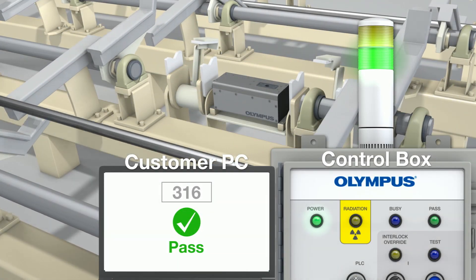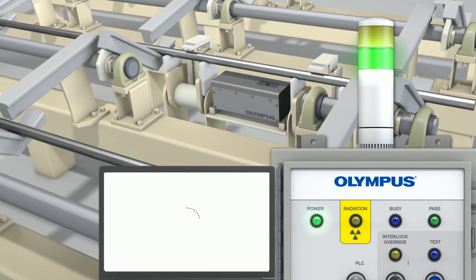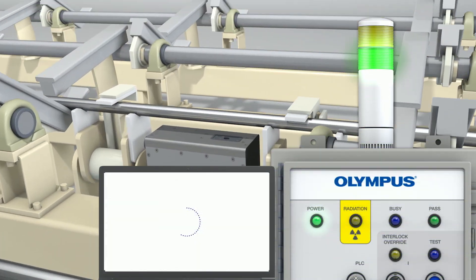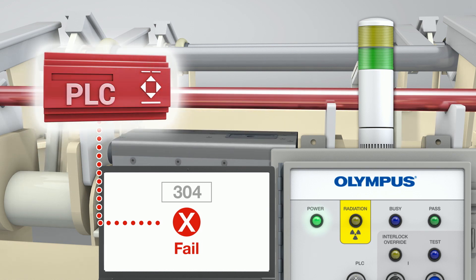Using this information, the FOXIQ analyzer can display the material chemistry or determine if the material meets specification and display a grade match, or make a pass-fail determination. If your facility is automated, the pass-fail result can be communicated to a PLC for material disposition.